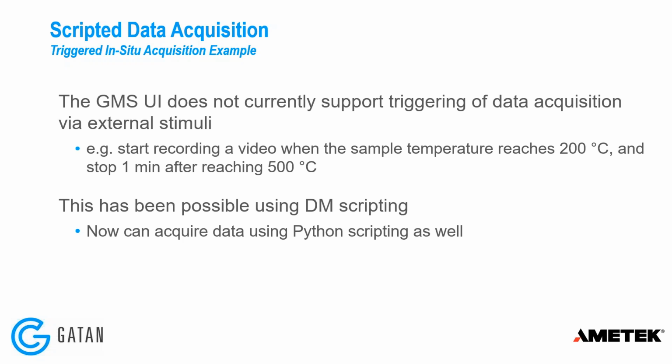For example, I might want to start a video when my sample reaches 200 degrees as I'm heating it in the microscope, and then maybe stop some specified amount of time after reaching a final temperature.